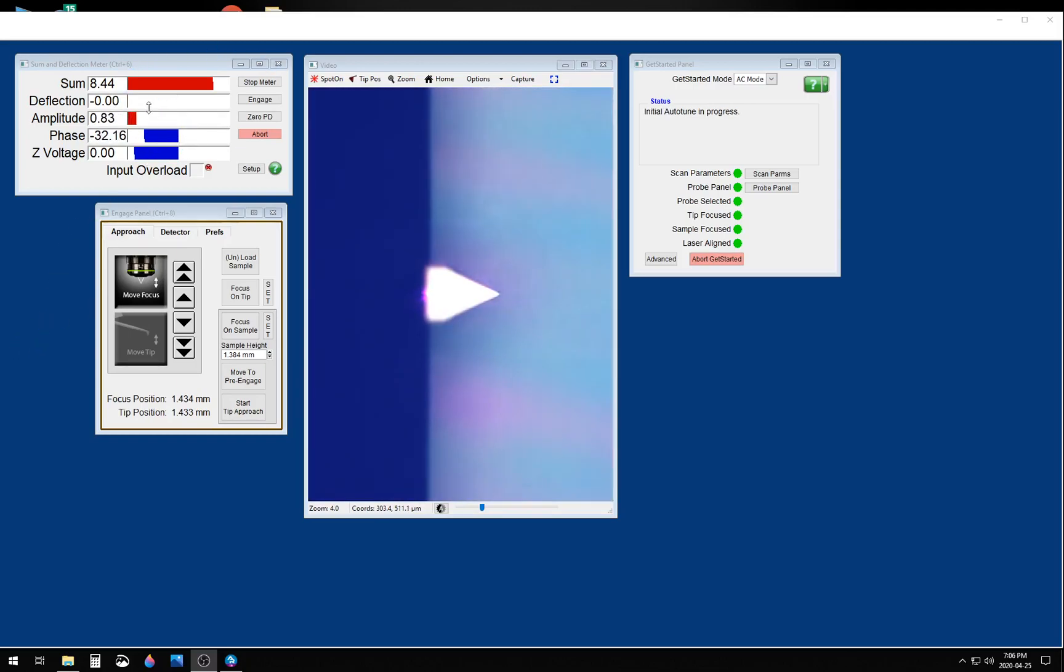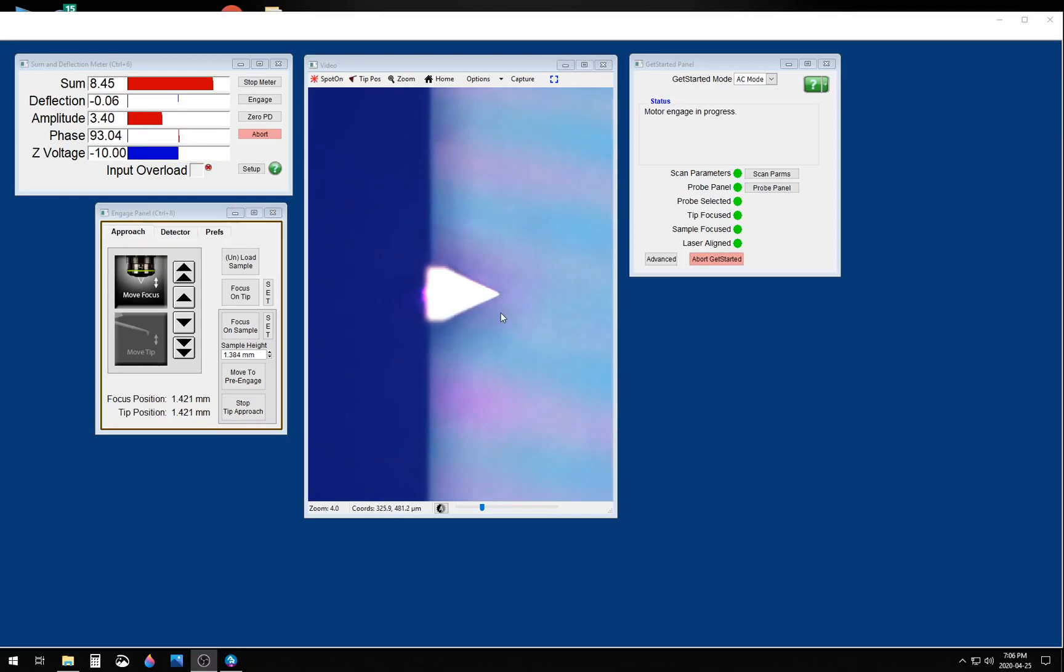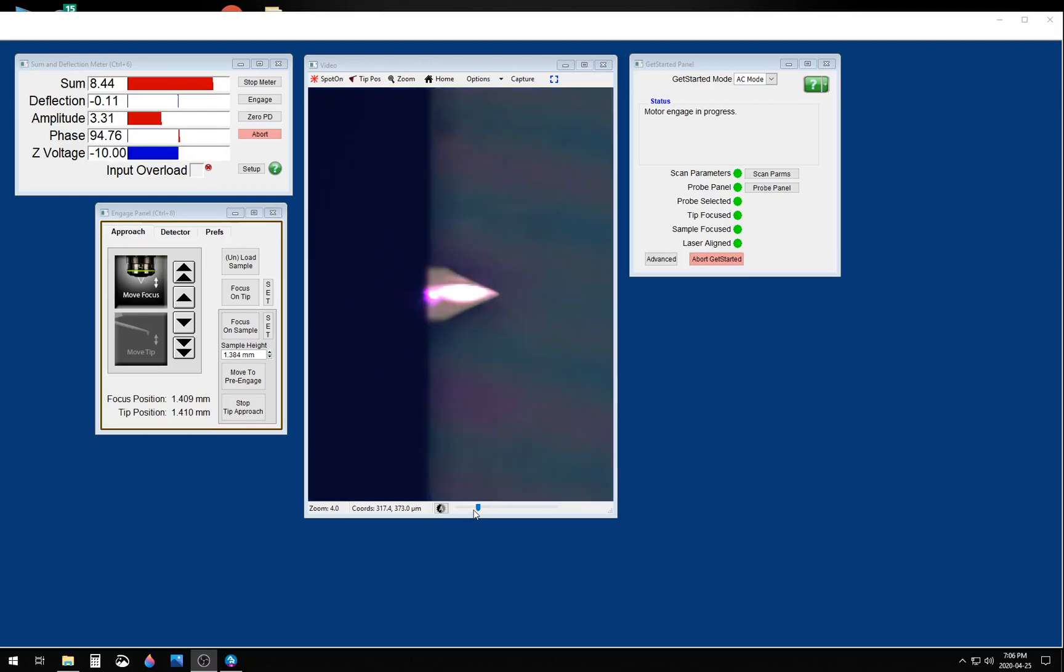It will pick a free air amplitude that is appropriate for the sample. Now it is motoring the tip down to find the surface, and once it finds the surface, it will retune the cantilever close to the surface.